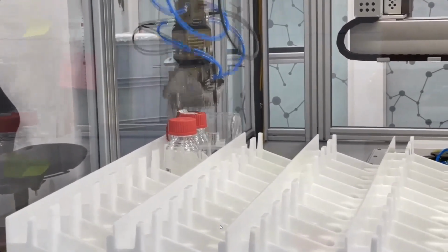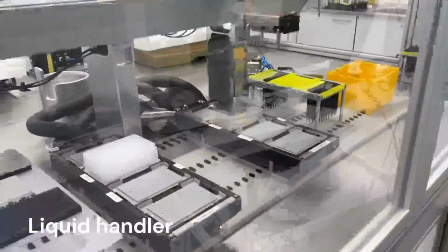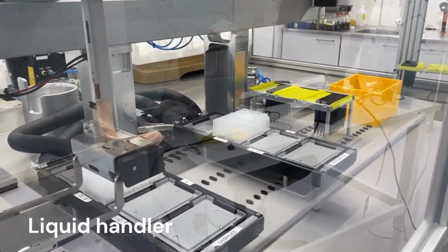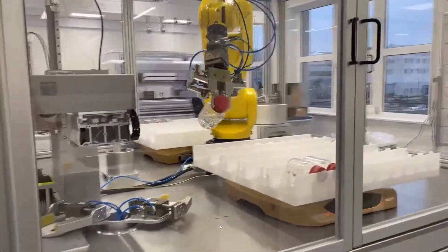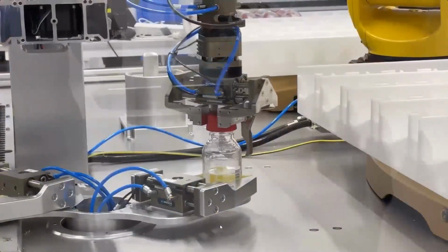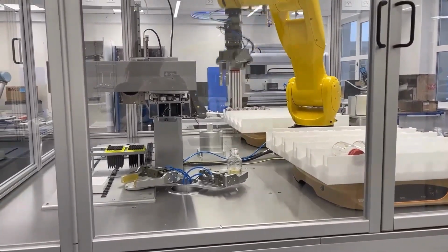After doing all of them, they're going to dissolve them. And then we use the liquid handler to transfer them to the microtiter plates, so at the end we can put them into the HPLC for analysis.